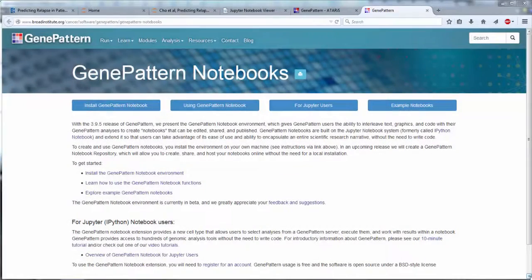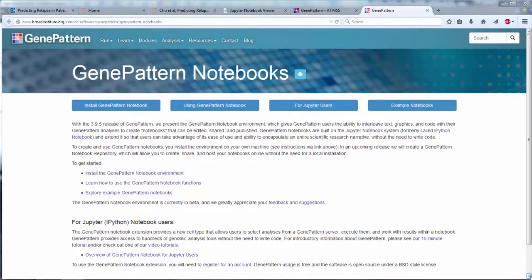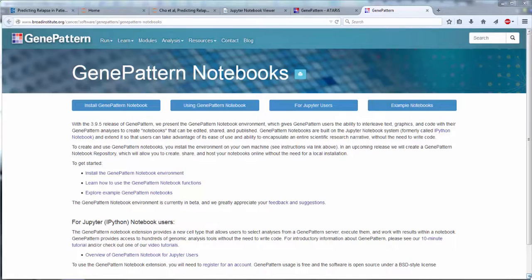The GenePattern Notebook Environment unites the capabilities of the Jupyter Notebook Environment and the GenePattern Platform to provide powerful analyses within the flexible notebook environment, all without the need to write code.